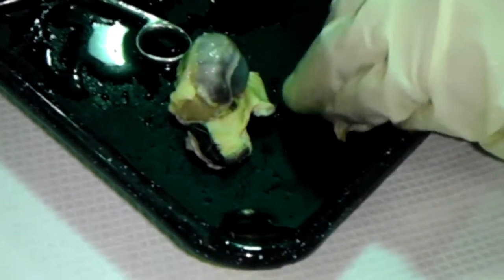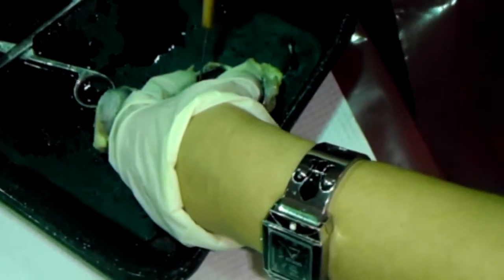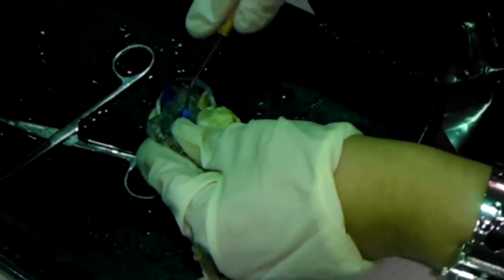And here, can you see this structure here? Let me show you. This is the optic disc here. This is the place that you have for the optic disc, where the optic nerve comes out. Can you see the optic nerve here? Yeah, it's a part of the optic nerve. So where the optic nerve comes out is called the optic disc. So this is the choroid, this is the retina, this is the lens.